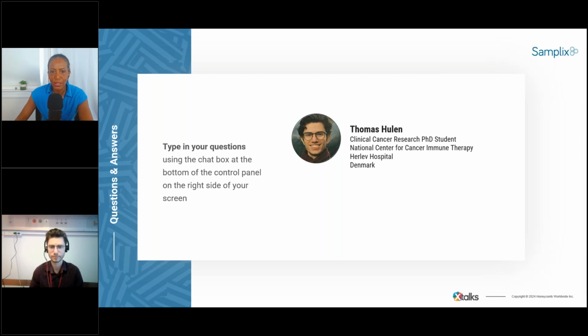Okay, we'll go to the next question here. What flow cytometer did you use in the Xdrop experiments? Do different optimizations need to be done for each cytometer?